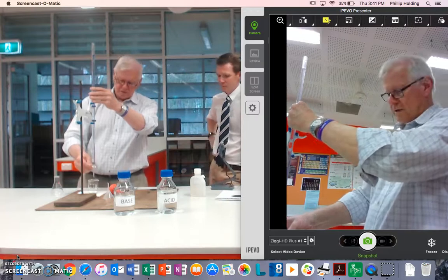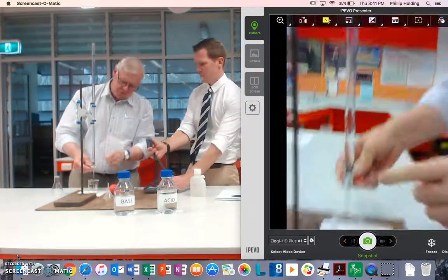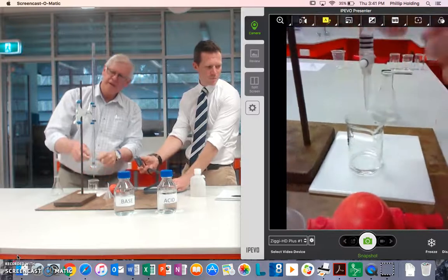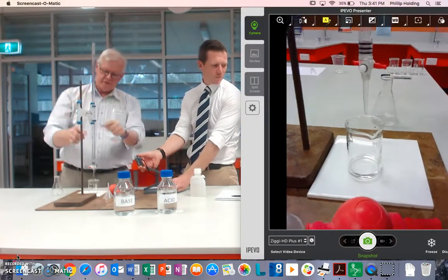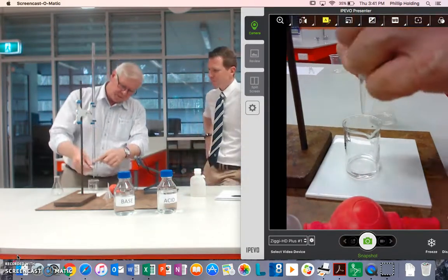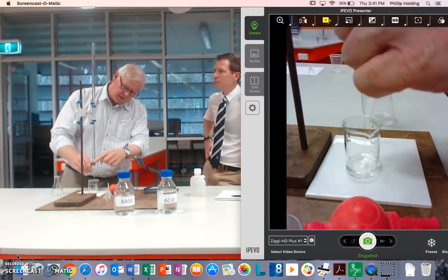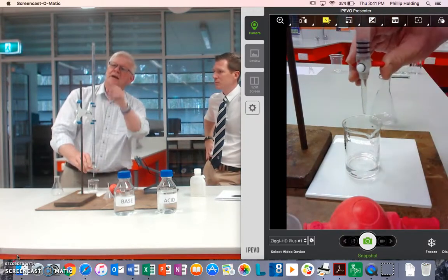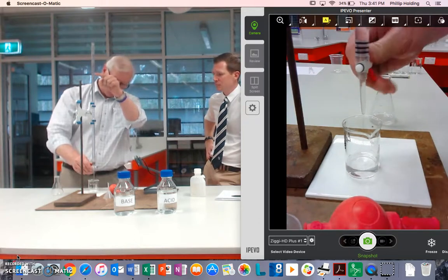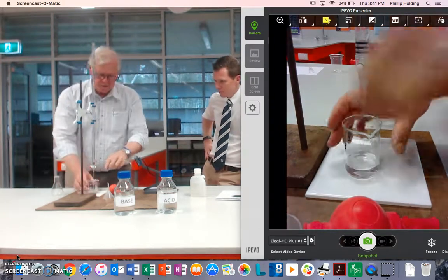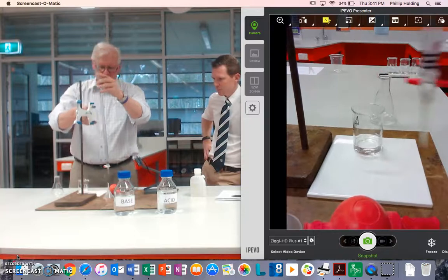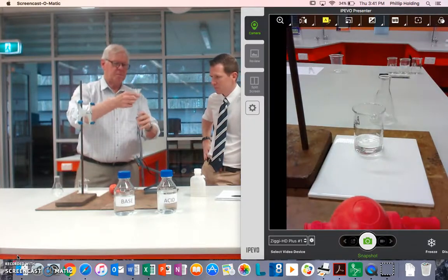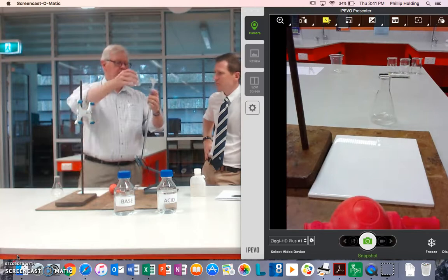So we control the tap. Now, at the same time, we've got to blow any air bubbles out of here, and we don't want any air bubbles in the burette as well. But the big thing is to blow the air out of here. Sometimes that takes a little bit of doing, and I've run a lot in to get that air bubble out. Well, that's not a problem because I will very quickly put it back in. So we've got to get the air bubbles out.